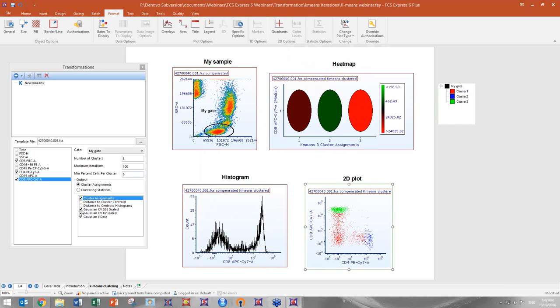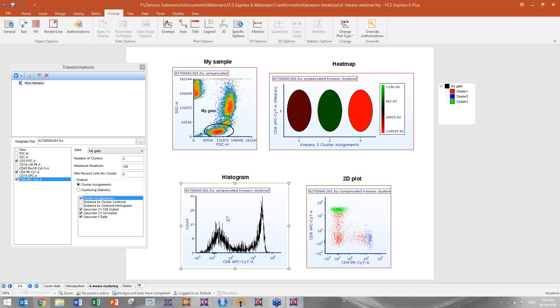You have just to select one of these other 5 K-means parameters, and once you apply the transformation on your object, this parameter will be accessible as a standard flow parameter. You see here, this is one of the parameters that also Alison showed us a couple of minutes ago.